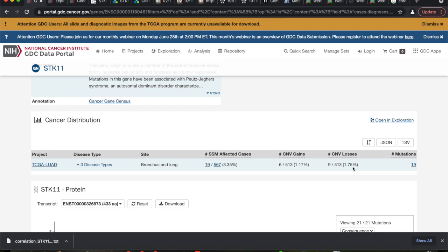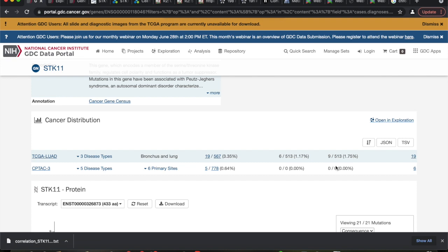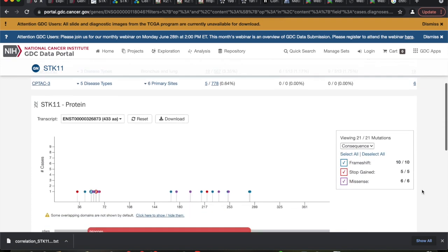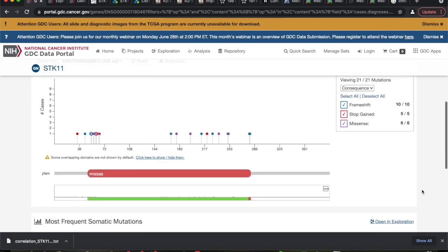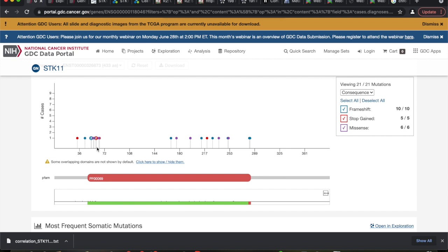That's exactly right. Most of the time when a gene gets mutated, it's a bad thing — something destructive. You do have mutations like KRAS where you mutate a regulatory element and it enhances activity, but a lot of mutations actually decrease activity. We're seeing more losses with this particular gene, so we'd think tumor suppressor. Going down we can see all the mutations found in the samples — there's a grouping here near the start.